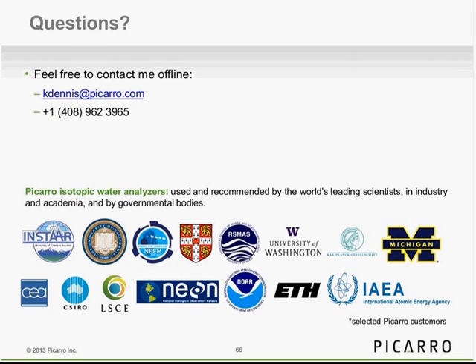We do want to continue to improve our methodology for soils. I really want to get into the lab and do some spiked water studies with soils. It's a matter of time getting in there and doing that. So the IM, I would say, is certainly worth a shot with soils. I wouldn't necessarily guarantee the performance with soils, and I would certainly encourage people to make sure they are at least initially doing some methods development to measure those soils with the induction module and cross-checking it with other techniques.